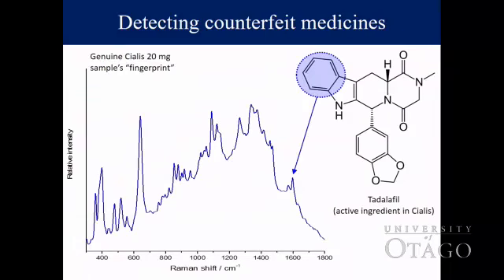So this is an example of a fingerprint of a genuine product, and for example this peak here is associated with this part of the molecule. So if we have different molecules or different ingredients in the tablet, this fingerprint will look different.